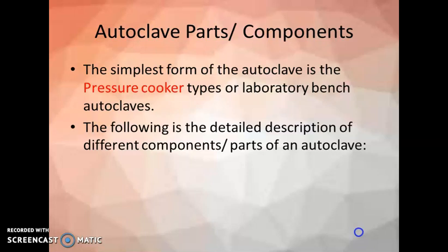Next is about autoclave parts and components. The simplest form of autoclave is the pressure cooker type or laboratory bench autoclave. The following is a detailed description of the different components or parts of an autoclave.